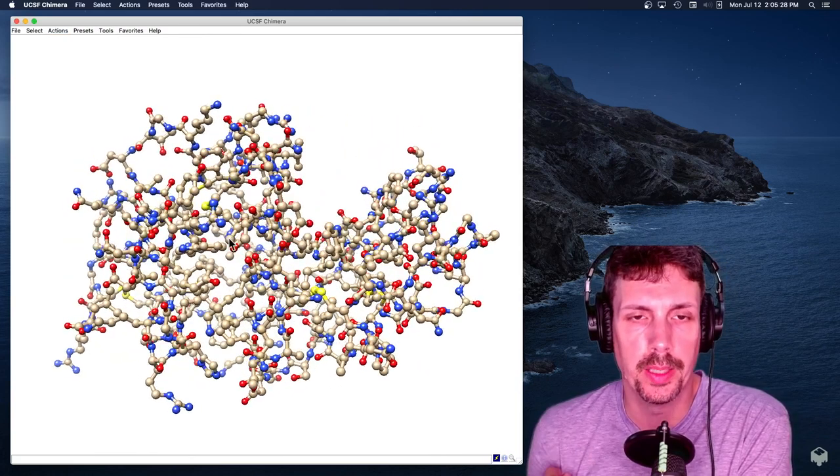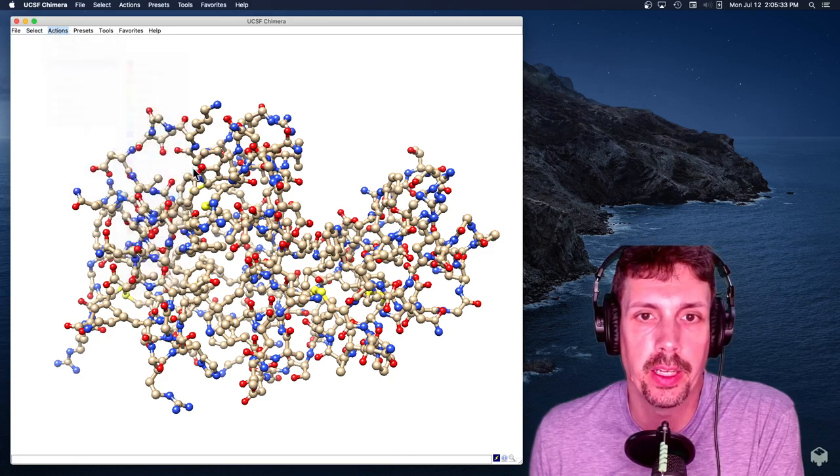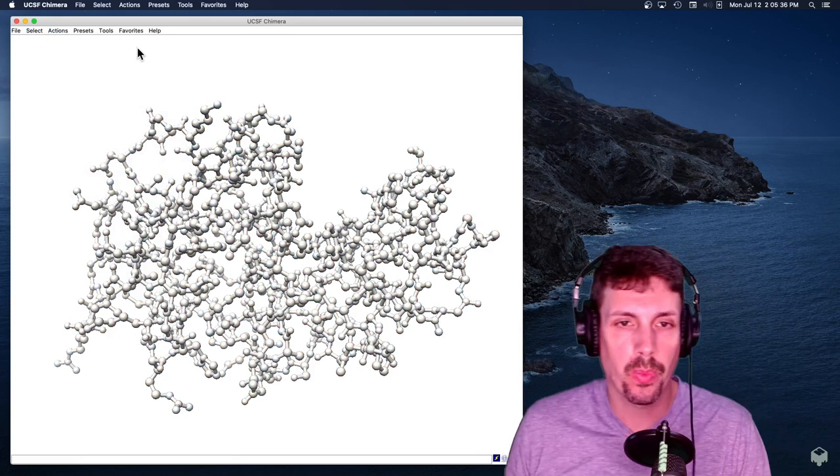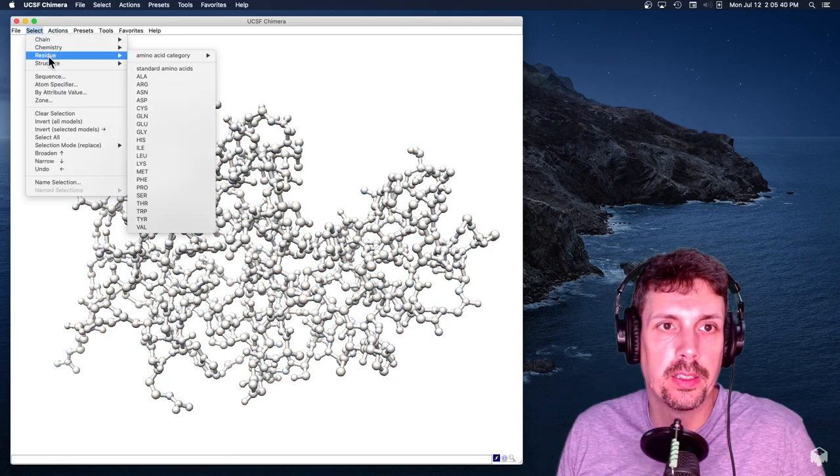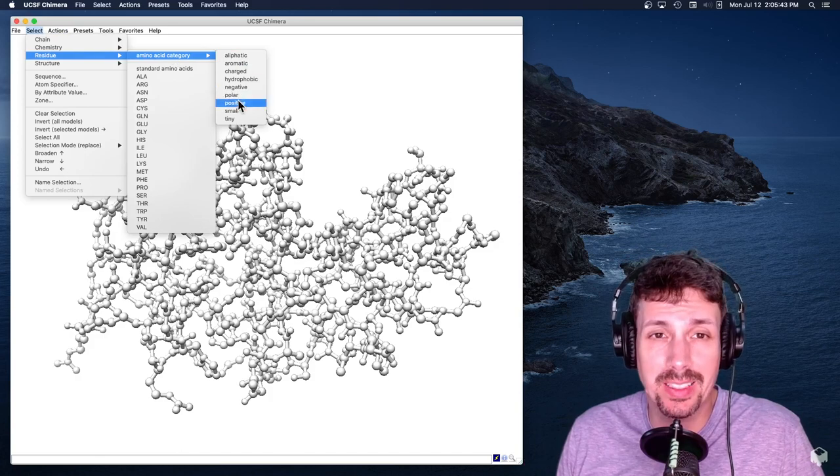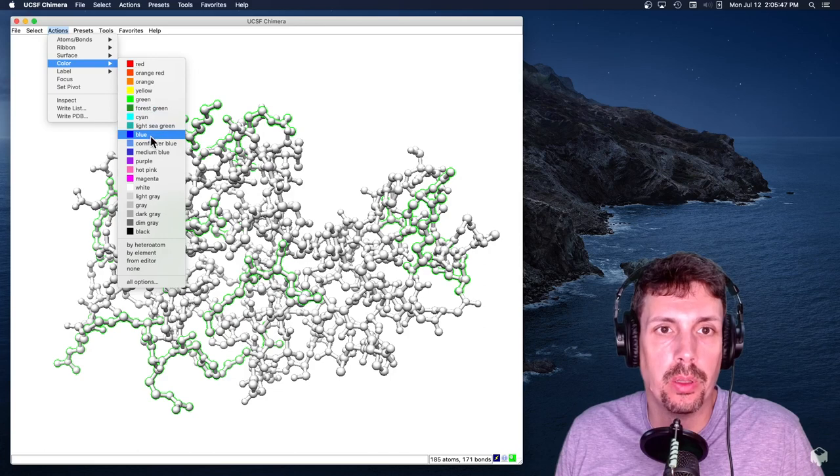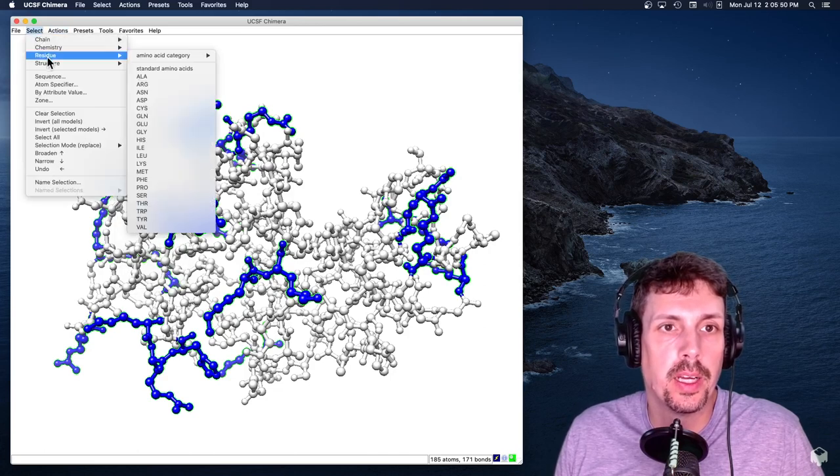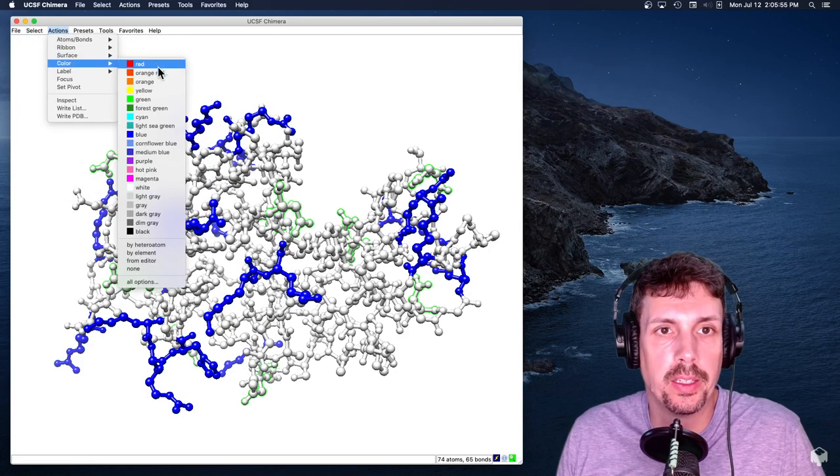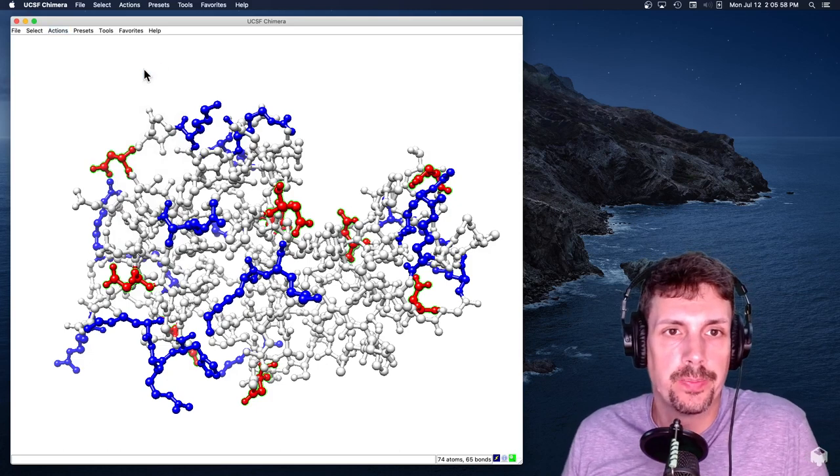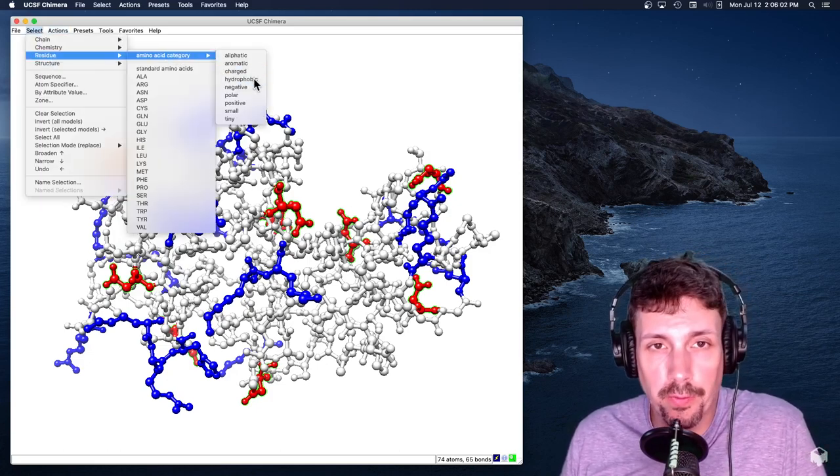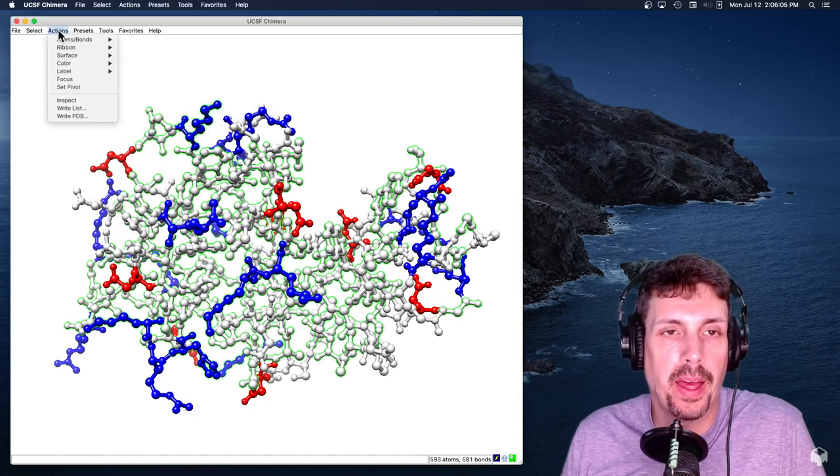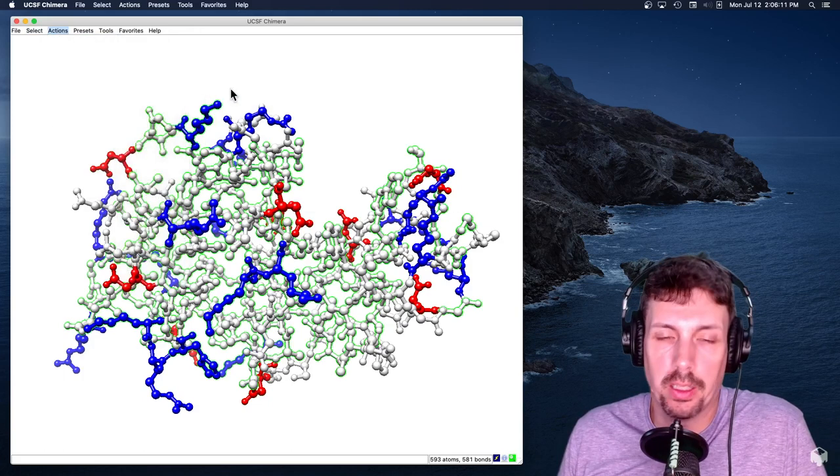All right, so now I'm just going to kind of color the whole thing light gray as a base to start with. Okay, and then I am now going to select different types of residues. So I'm going to select all the positively charged ones, and I'm going to color them blue. I'm going to select all the negatively charged ones, and color them red. This is kind of the common convention. And then I'm going to select the hydrophobic atoms, aren't really residues. And I'm going to color them yellow.